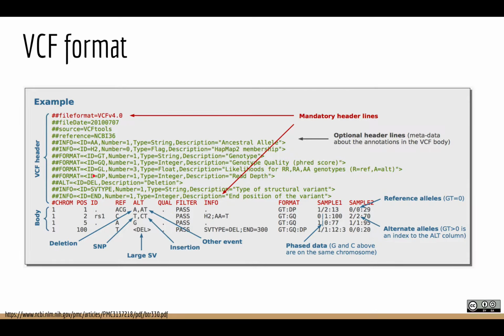These format fields are pieces of information that are associated with the genotype of each individual. So remember, each of the rows in this file are sites at which one or more individuals that were sequenced are polymorphic. So let's imagine we give it 3 BAM files for a mom, dad, and a kid. GATK is going to look at all those BAM files position by position in the genome and look for sites where at least one of those 3 members of the family were polymorphic. When it decides that there is genetic variation among those 3 individuals, it then has to figure out what the most likely genotype is for mom, dad, and kid, or for everyone in this room, or for 1,000 genomes, or for the state of Utah, right?